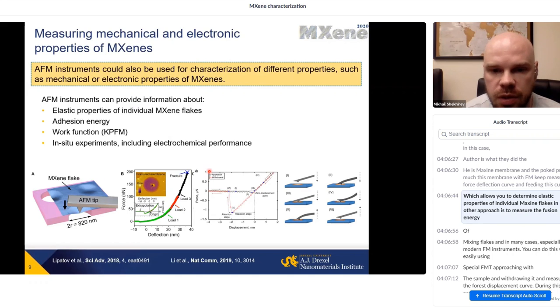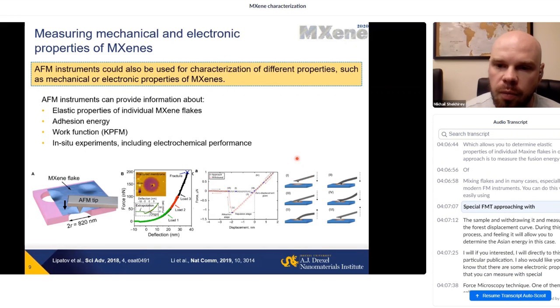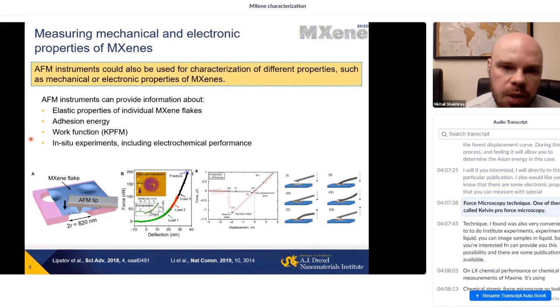Another approach is to measure adhesion energy of MXene flakes. In many cases, especially in modern AFM instruments, you can do this very easily using a special AFM tip approaching the sample and withdrawing it, measuring the force displacement curve during this process and fitting it. It will allow you to determine adhesion energy. If you're interested, I will direct you to this particular publication. I also would like you to know that there are some electronic properties that you can measure with special force microscopy techniques. One of them is called Kelvin probe force microscopy.